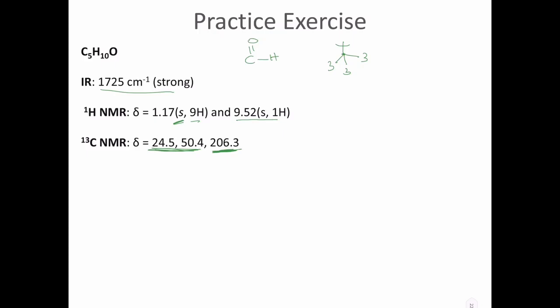Okay. So all we know from here is that we have the 4 carbon atoms and the 5 carbon atoms. So we got it. All we need to do is put it together. So we have that connected to a hydrogen, connected to that. That gives us the correct structure.